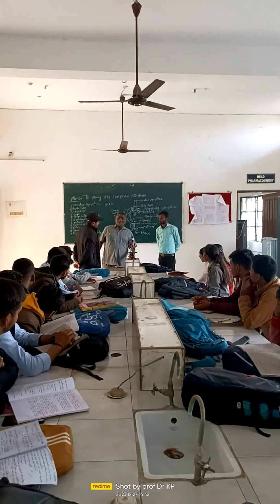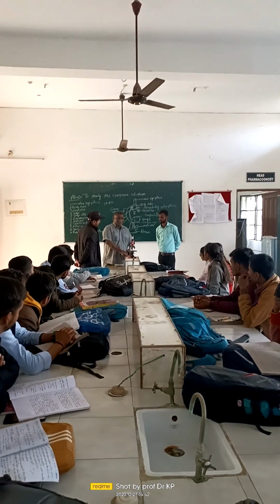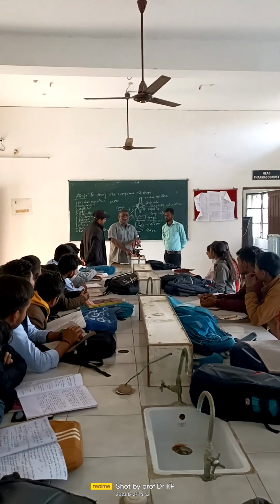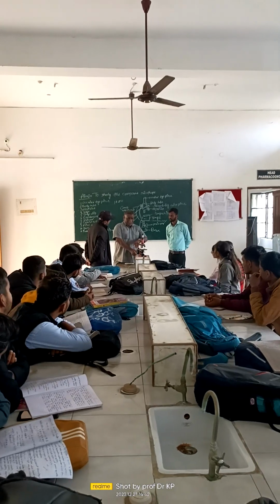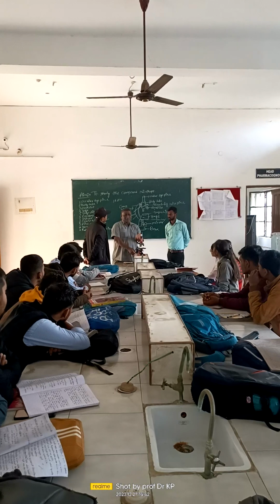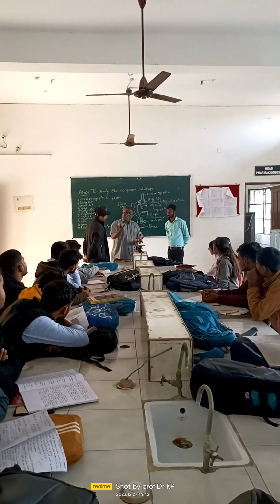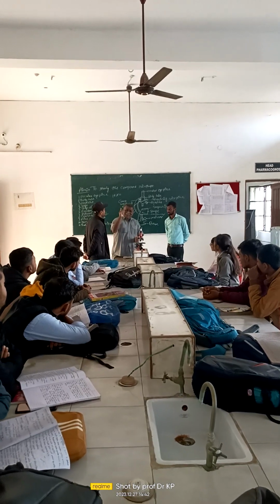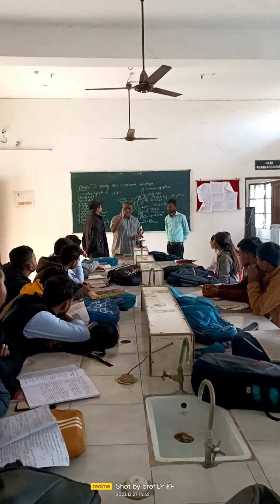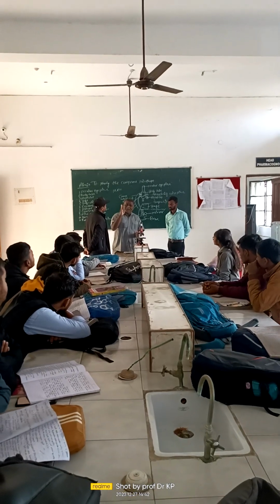You will be using a compound microscope with 3 powers. Maximum 5x or 10x is put in with the eyepiece. Sometimes 10, sometimes 5. Some colleges will prefer 15 also. And over here, there will be 10x, 45x, 100x. 10x is called low power, 45x is called high power, and 100x is called oil immersion.